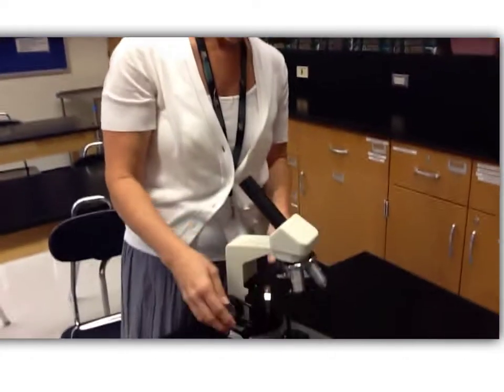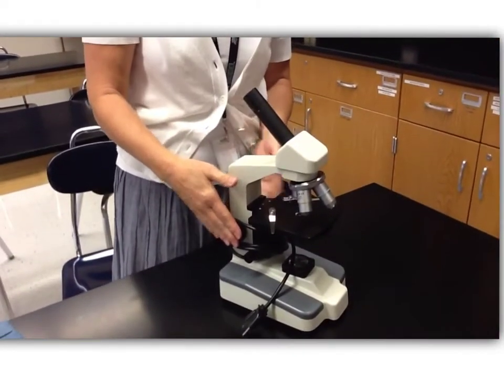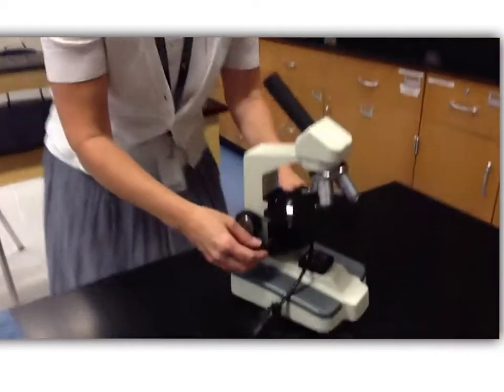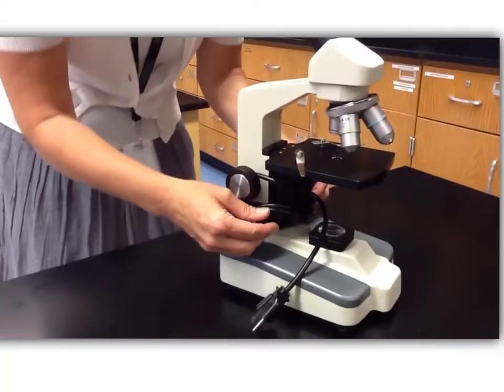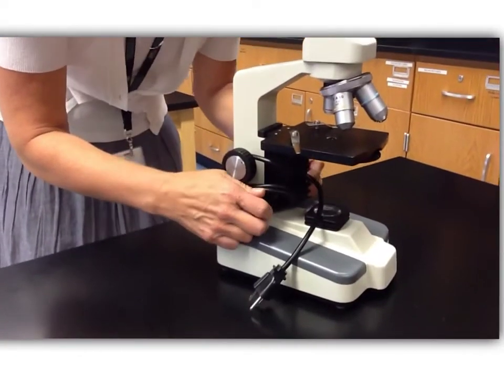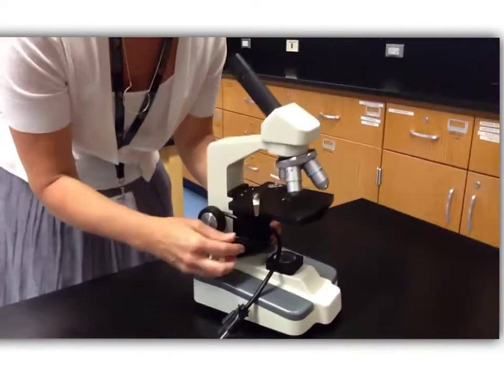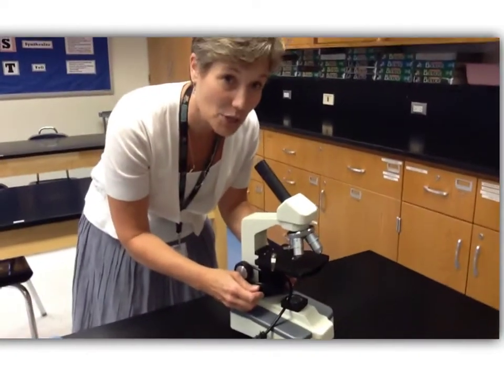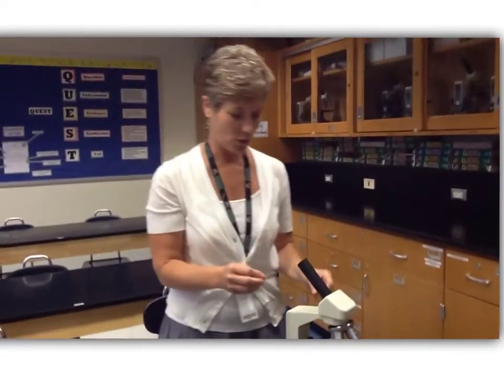When you have your object in view and it's kind of focused, then you're going to use the fine focus knob. The fine focus knob is going to also move the stage, but it's going to move it in such a small amount that you can't see it visually, but it's moving it to focus the object, so you get really sharp focus.